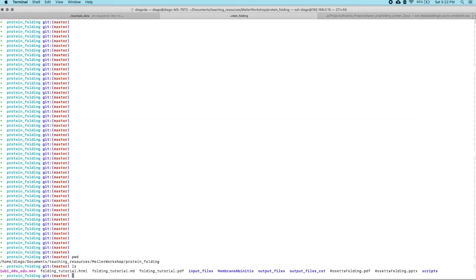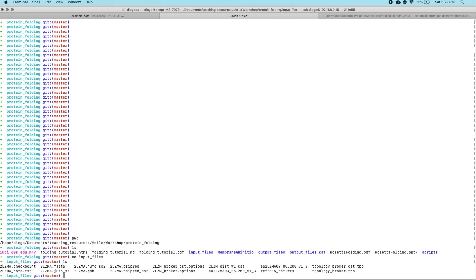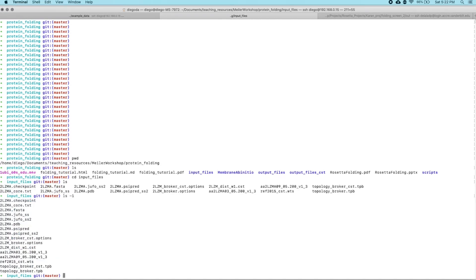We have a PDF and an HTML of the tutorial itself if you want to take a look at that. For now I'm just going to go into the input files directory, do a quick ls so we can get a better idea of what's going on. You can see there's a lot in this directory already, and essentially we already have everything we need to fold T4 lysozyme, which is our test protein using Rosetta.